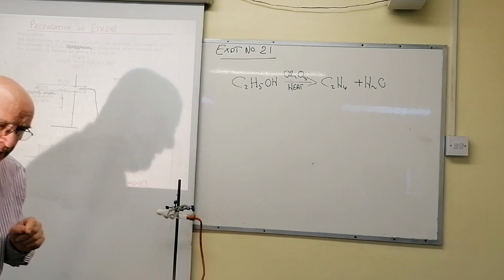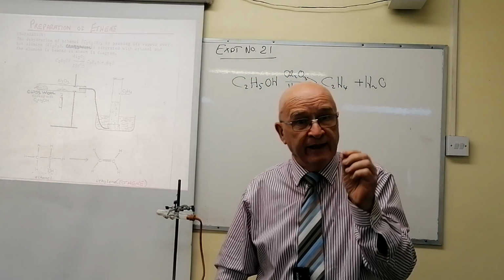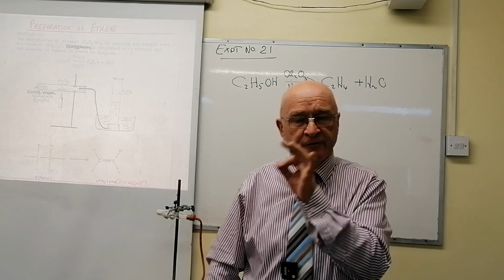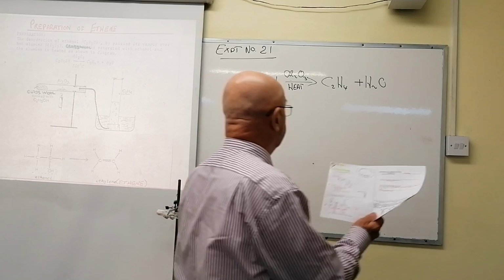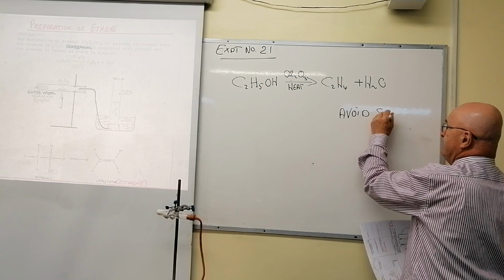And what will that do? The cold water will be hitting glass, which is very hot, so the glass is going to crack. And the gas inside is quite flammable, so that will be dangerous. Now, that process is known as suck back. And will you be careful with it, please? Avoid, that's what we say, avoid suck back.